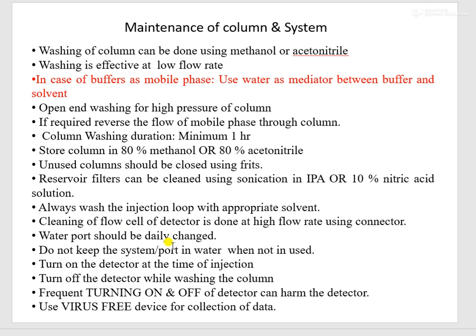Water port should be changed daily, because if you don't change it, there will be a generation of microorganisms, or there will be a growth of microorganisms. So you have to change your water port daily. If the system is not in use, you have to remove the water port, and you have to keep the system in organic solvent. Do not keep the system or port in water when not in use. This I have already discussed.